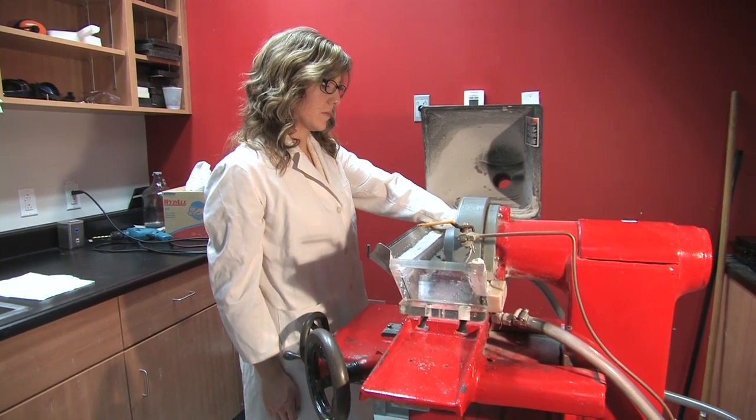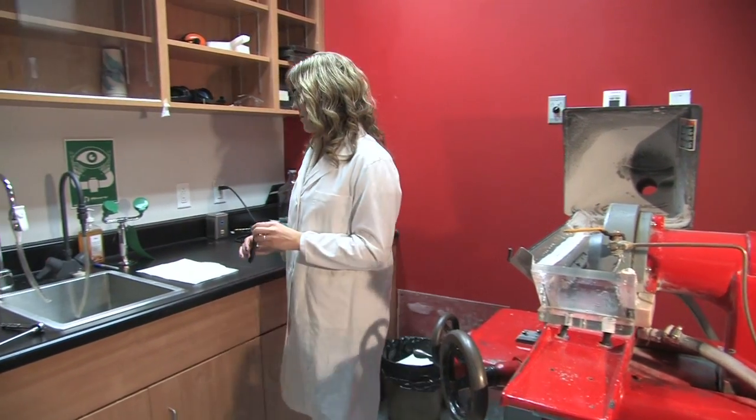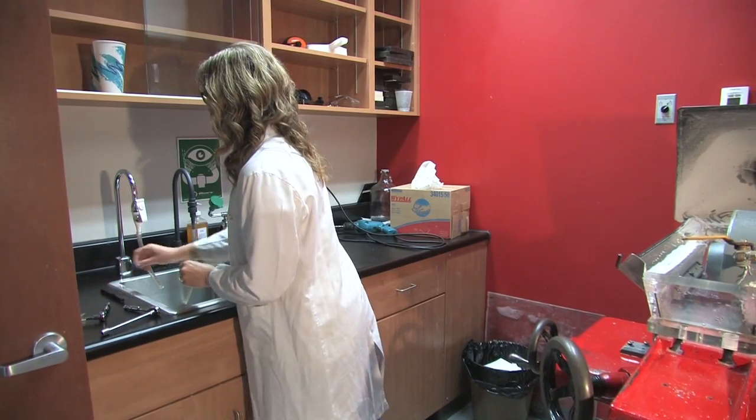Remove and discard the first piece that falls off. This contains the outer regions or anterior halves of the otoliths and these are not used for aging.